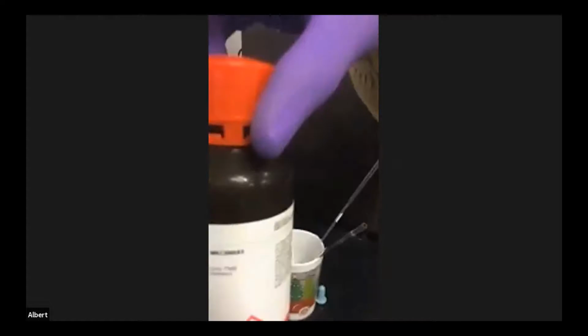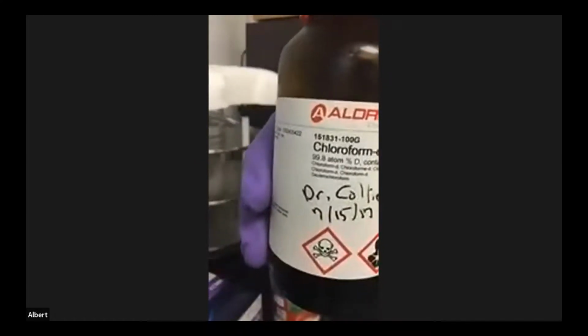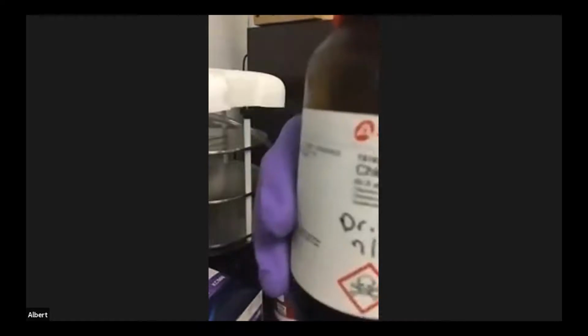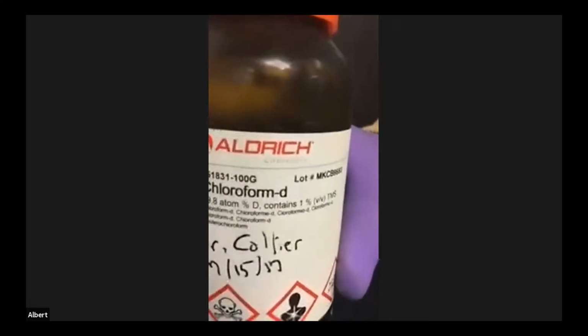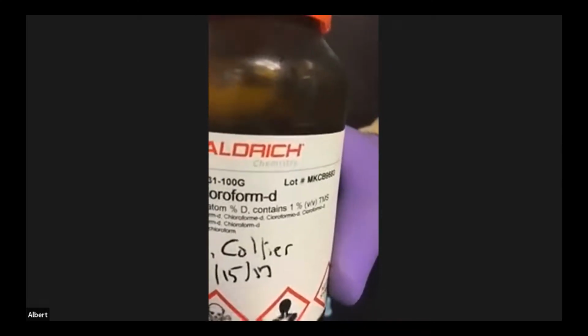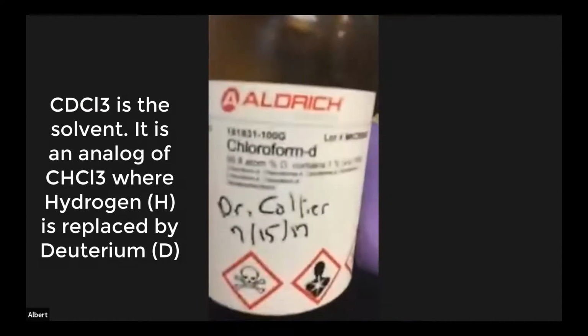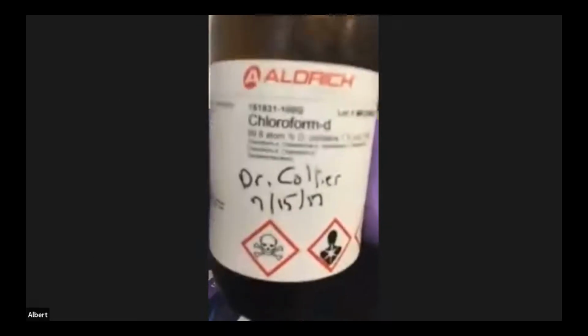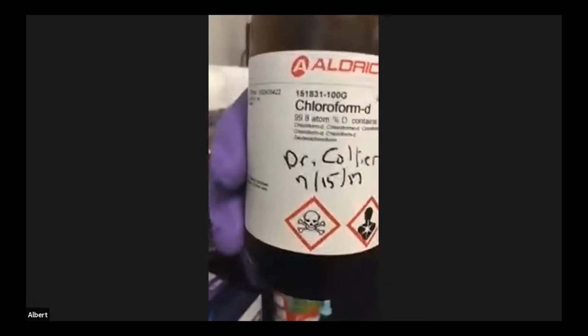So this is deuterated chloroform, and the reason why we need a deuterated solvent is because within the NMR, there's a superconducting magnet, and that magnet needs something to lock onto. Since we're doing proton NMR, we're using deuterium in the solvent, which is an isotope of hydrogen. That deuterium is what the magnet is going to lock the signal onto. If you did it in a protonated solvent, then the solvent will be competing with your compound if you're doing proton NMR. So you got to use deuterated solvent.